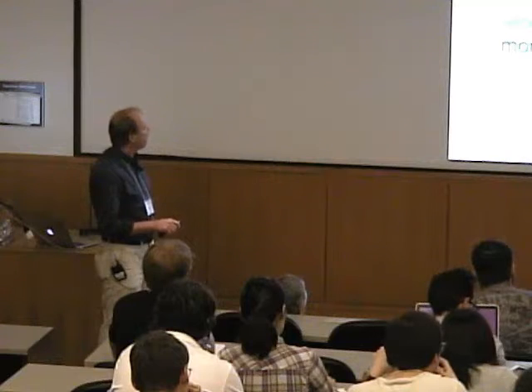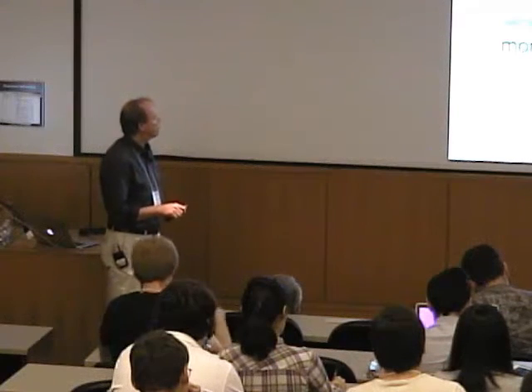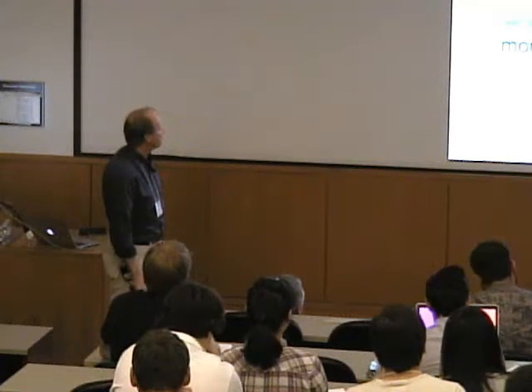And then an area which I work in a fair bit, which is maybe a little bit neglected, is that we can also look at excited states which have a spin not equal to 0. So if I excite a molecule into its triplet state, we can observe this. And we have a practical, the EPR3, where we look at some triplet states.